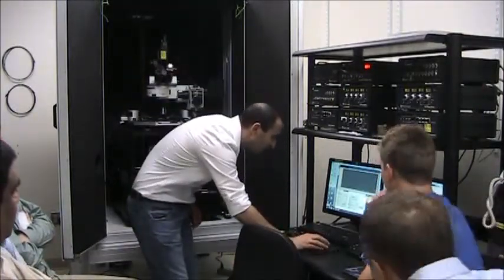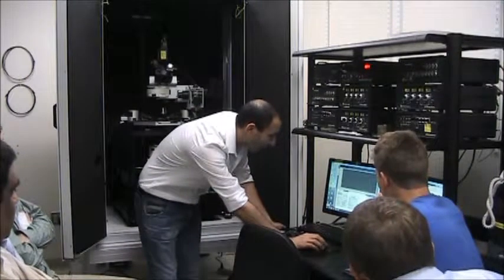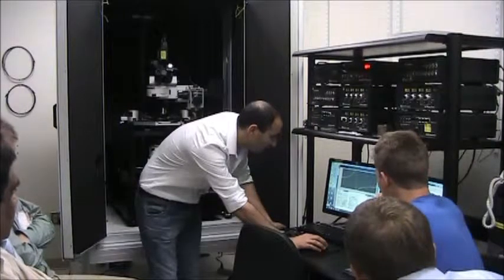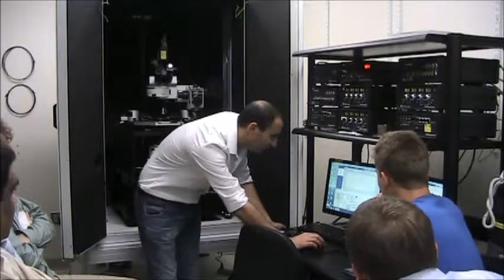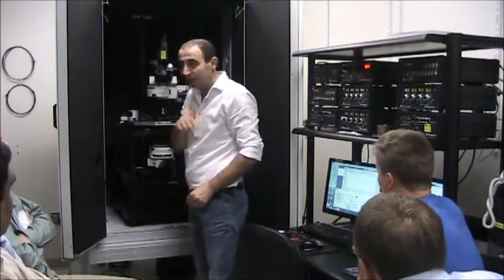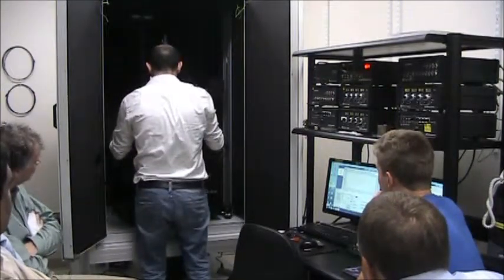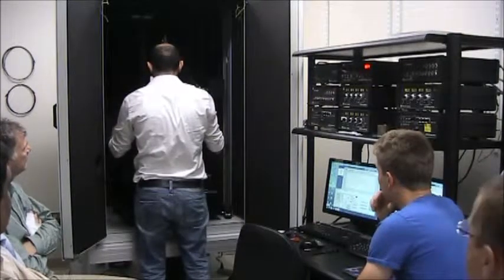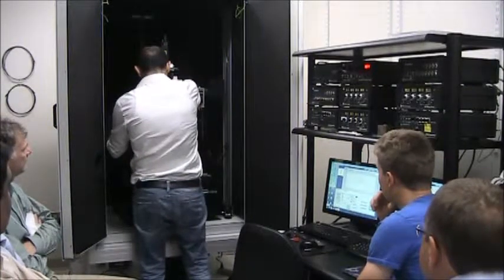So then we shift to phase. Okay, and we select the zero value here, which is the resonance frequency. And when we're ready to approach, we just put the tip in the correct place above the surface, and we'll be ready to go. So I move the tip in. There is a rough motion first, so we slide it out to put it in, like in the case where we have two probes.